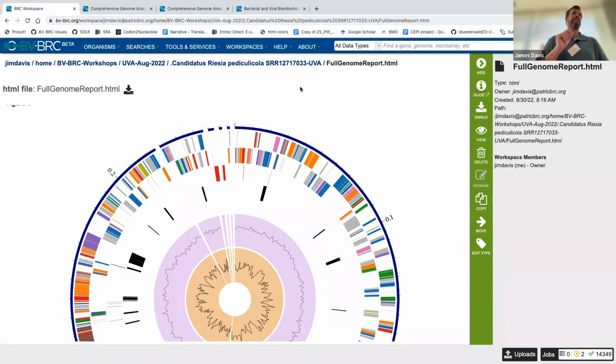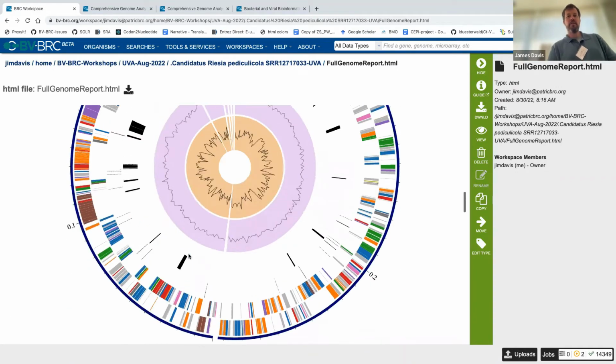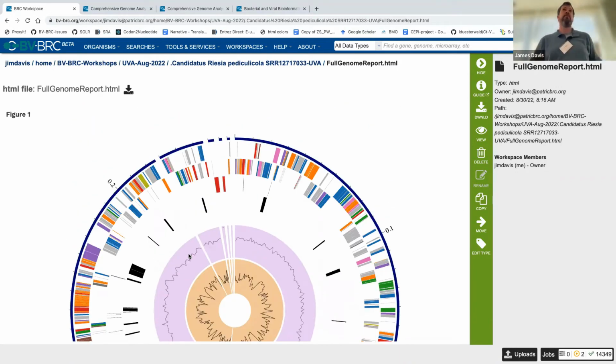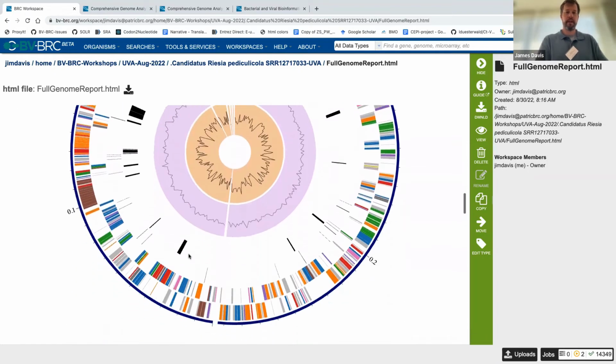It probably is. But look how it kind of cheats a little bit, because if you look up here, here's your first contig, second, third, fourth, fifth, or maybe there's 2 here. Oh, there's 2 here. So it makes it look a lot more beautiful and perfect than it is. And in reality, we don't know what combination those come in, because if the assembler couldn't figure it out, then more work would need to be done to build scaffolds or something in order to figure that out.